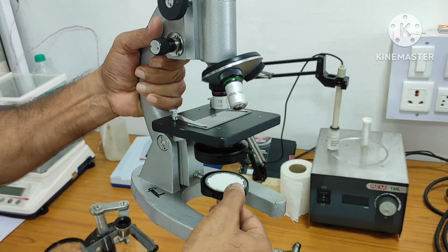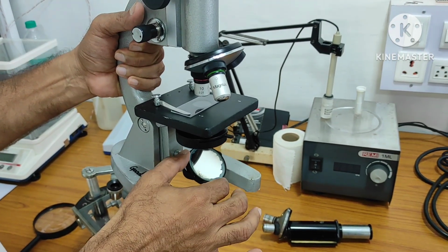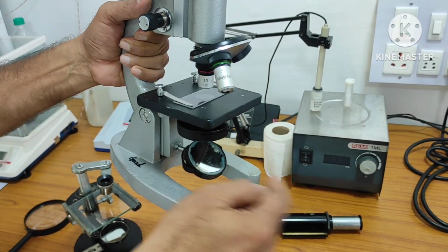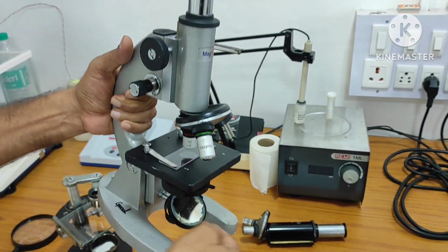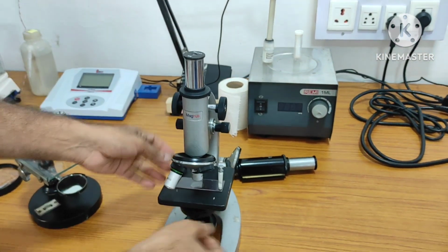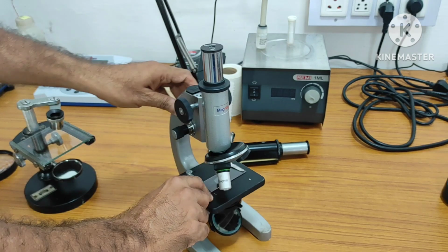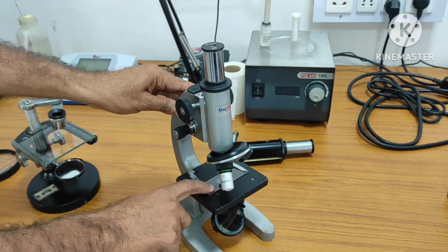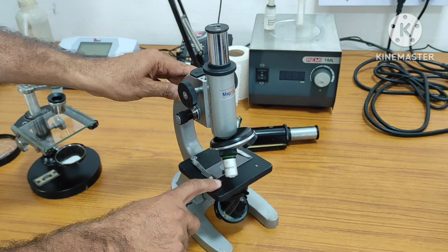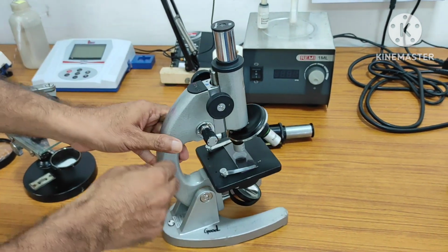This is called as mirror again here also. So here also natural light only we can use. We have to adjust it so that light will fall on that, and then the reflected light will pass through this, through the path, and in between somewhere specimen is also there, that is thin section only. So thin section only can be observed. The ultra thin sections we can observe better, right?